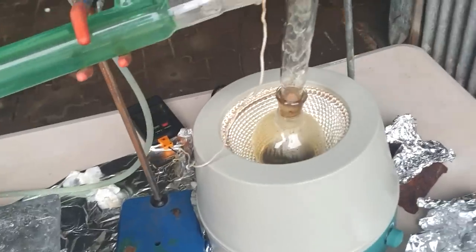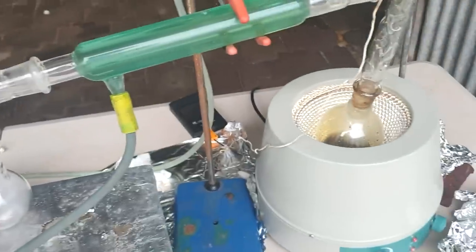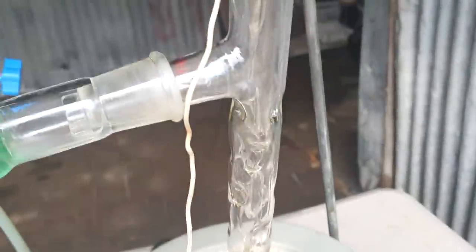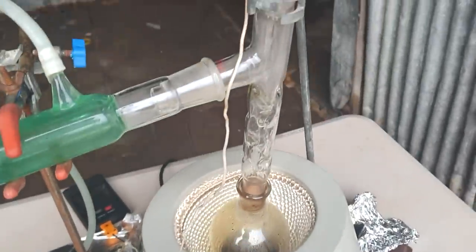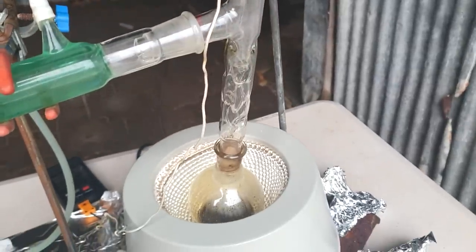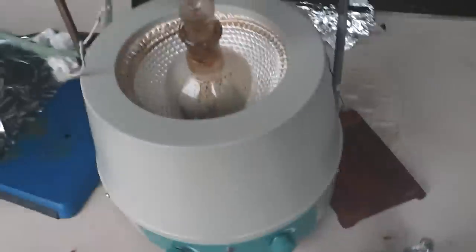Hoping to get this next bit over, but I just can't get it distilling over very well at all. Maybe my vacuum pressure is just not high enough. It's really starting to decompose. Got this whole fraction here, which I'm pretty sure is just our solvent. Really nothing is coming over of this. I don't know whether the fractionating column was a good choice for this then. It's really, really looking very tar-like in that flask. It's getting dark, but I reckon we're done here.